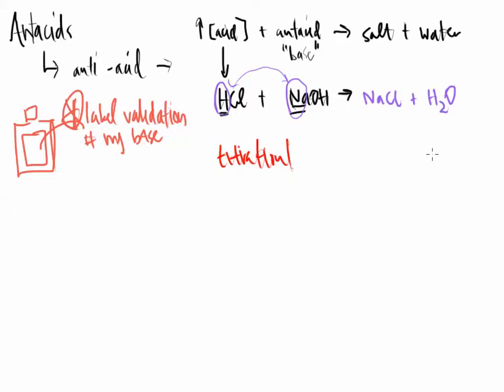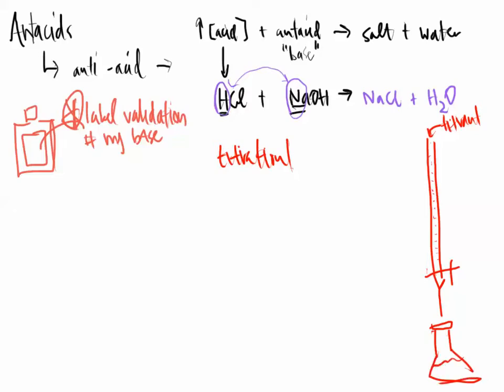Okay, so titration setup. You're already familiar with this already. We are going to have a burette, and then this will taper off down here at the bottom. And this burette will have a titrant in it. What that titrant is right now, I don't know. We've not talked about the procedure. We're just giving you an overview. Below, we're going to have a flask, something to put my solution in, and it's going to be my job to figure out the concentration of this solution.